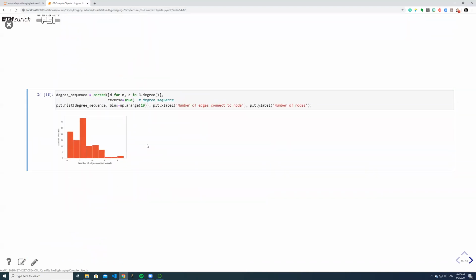Another one is to look at the histogram of how many nodes are connected with each other. So we see that we have many disconnected nodes, so that is a 0. Then we have a couple that are connected pairwise, and then very many are connected with 2 neighbors, and those are the ones that are connecting and providing a nice network. And then, of course, we have the more branchings here, and in the end, we have crazy regions with up to 8 connectors.